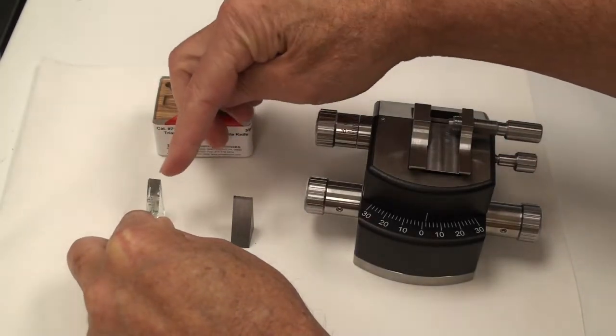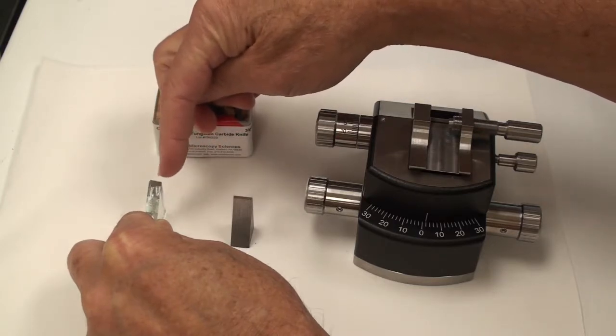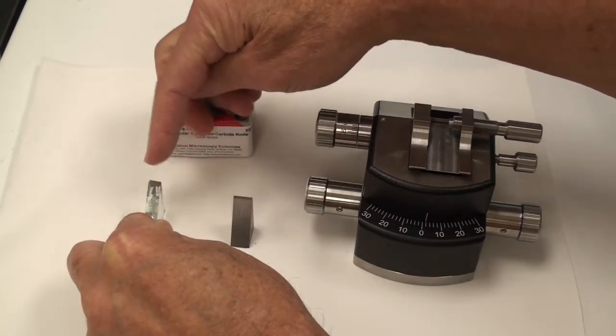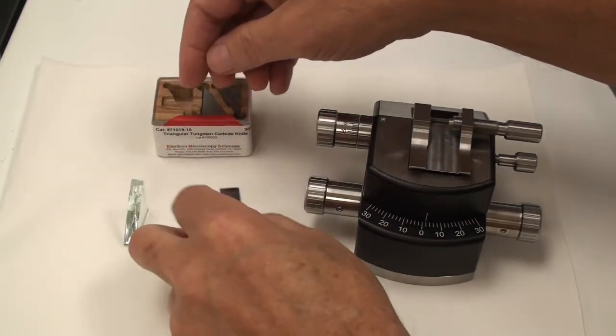Typically, we have either a glass knife or a diamond or a tungsten carbide knife. The problem with glass is the back of it is slightly curved, and so then your block face has a curvature to it.